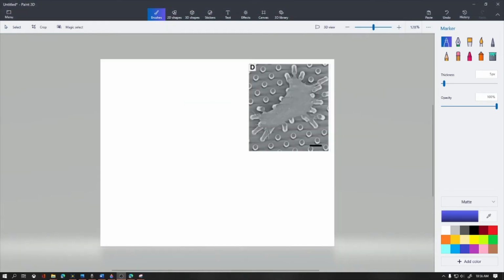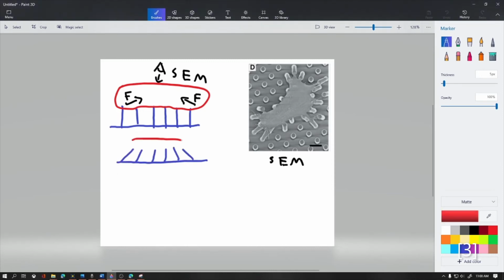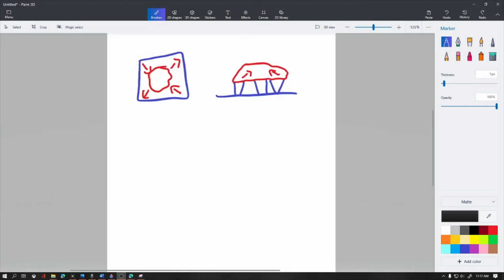Another promising method in the current literature is placing cells on top of little microneedles or microposts, and then calculating the forces of the cell based on the simple mechanics of how they deflect the post, all observed using scanning electron microscopy. You can also adjust post height or shape to test for anisotropy effects, or adjust the stiffness, for example, so it's quite a flexible method as well.